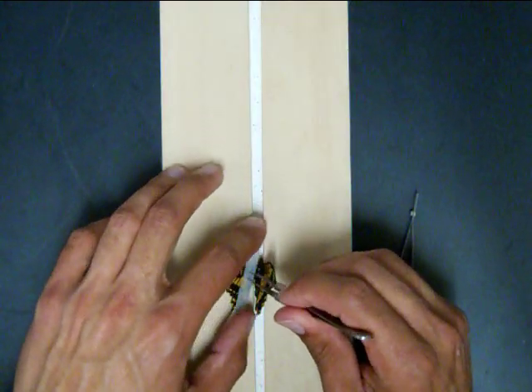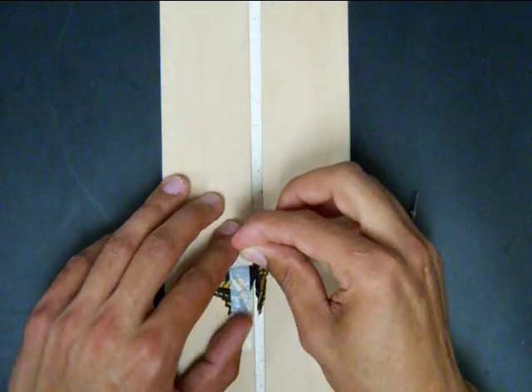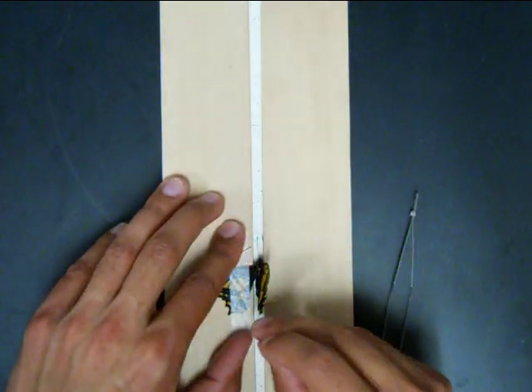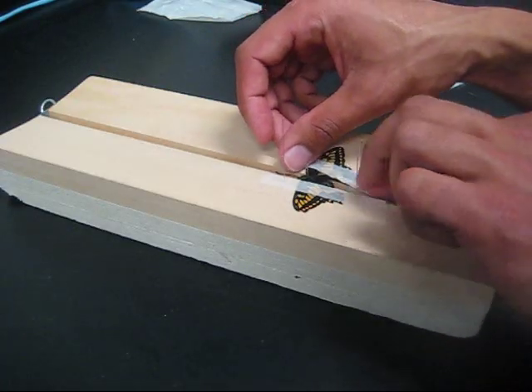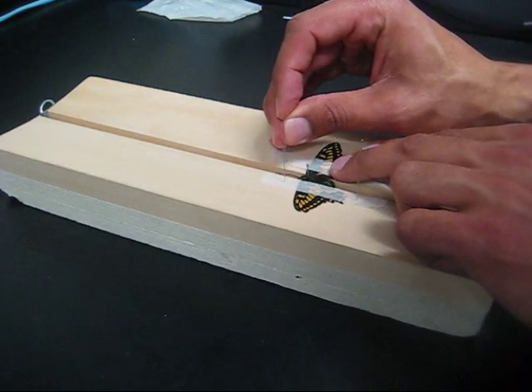Carefully push down on the left wings with a glassine strip and pin the strip to the board. Use the same method to secure and spread the right wings.